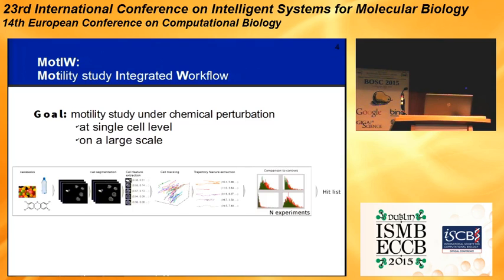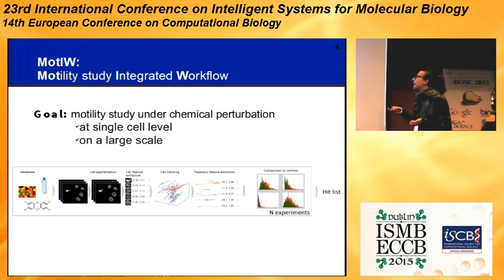First of all, the cells are exposed to some perturbation, as I was saying, either a small interfering RNA, a drug, or an environmental contaminant. The data is acquired. Following this, the objects on each image are segmented, so we identify the nuclei. They're quantitatively characterized. For example, we compute their mean intensity or their perimeter. This information will enable us to track the nuclei in 2 dimensions over time, which will produce a set of cell trajectories.